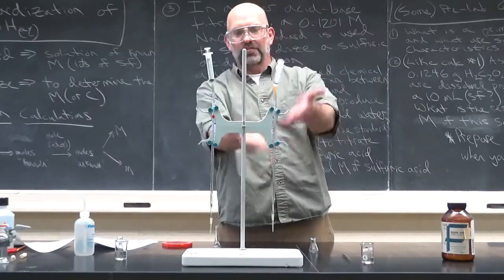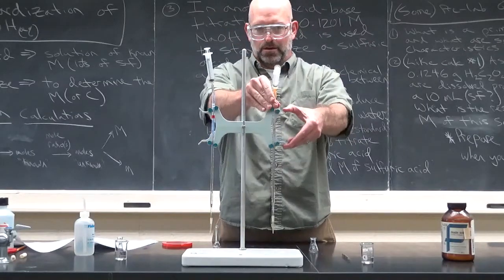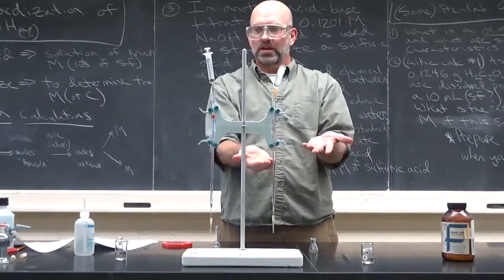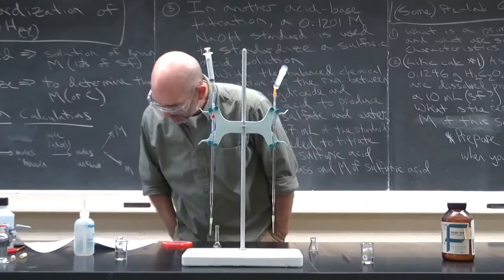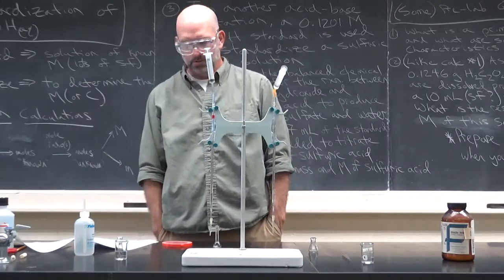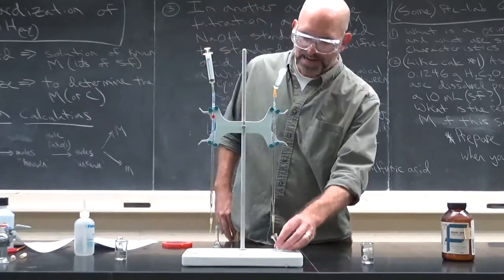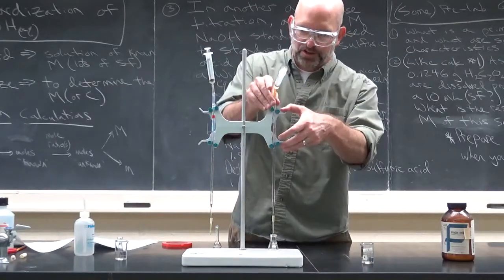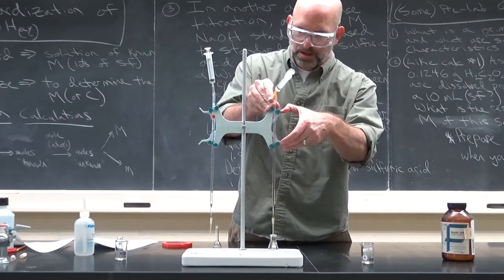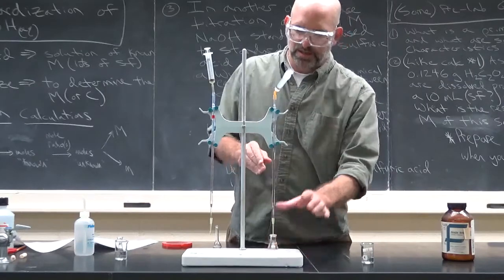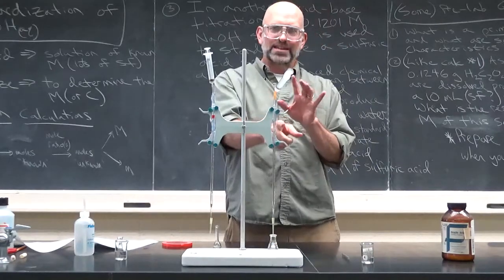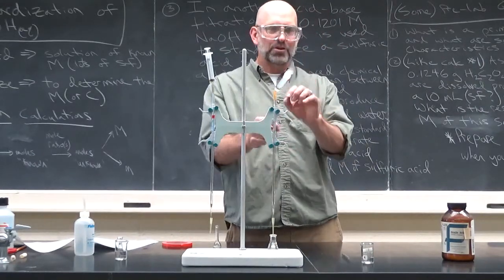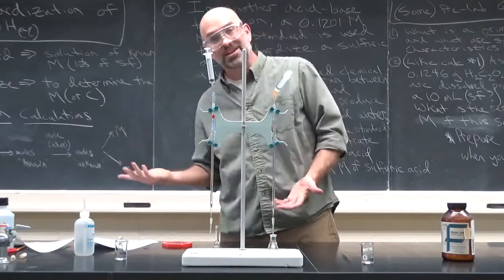So the initial volume on this burette right now is 0.00. It doesn't really matter, I'm just going to do this for argument's sake, because this isn't going to take very much. So say you only fill it halfway. Well, that's fine. Just write down the initial volume. And then it says to dispense one milliliter. Okay. But now, the procedure never tells you exactly what to do. But you're going to write down more than one mill in your lab notebook.